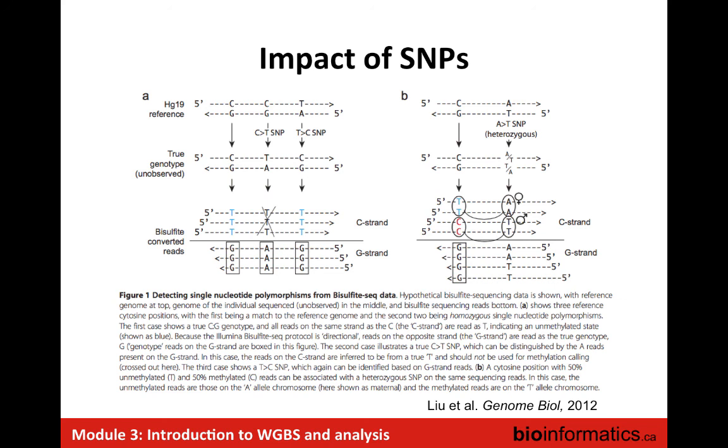are indeed problematic in terms of the output. So you can just mask those regions of common SNP, and then anyway, if the region is methylated, removing one of these bases will hopefully not affect your analysis. But since the methylation pattern is not the same in all the cell types, a separate and also important point is that if you have a complex tissue, that applies whether it's a variant site or not.